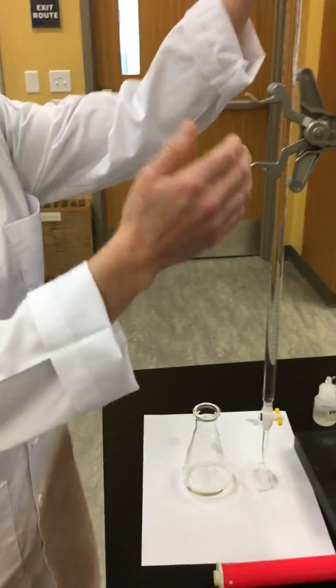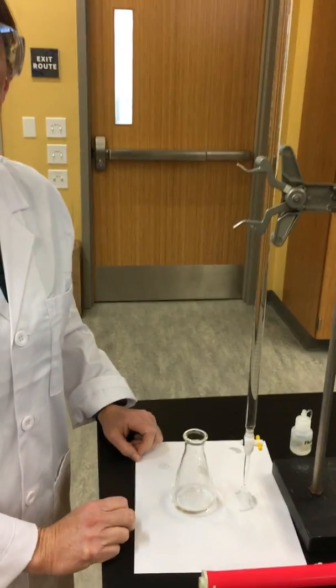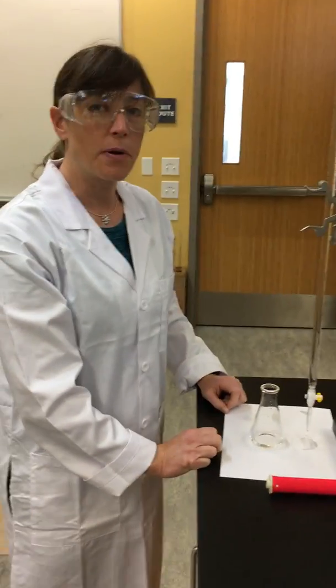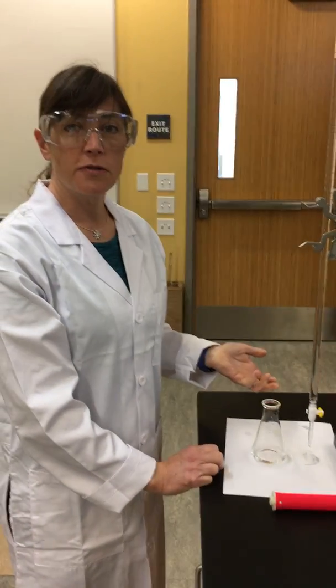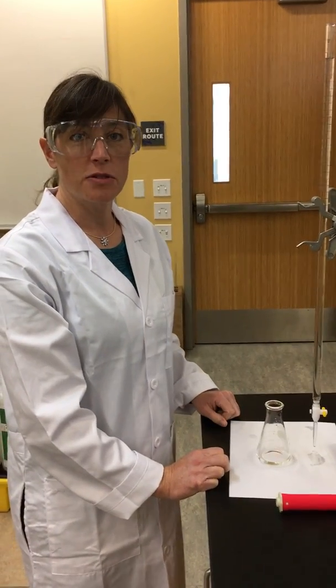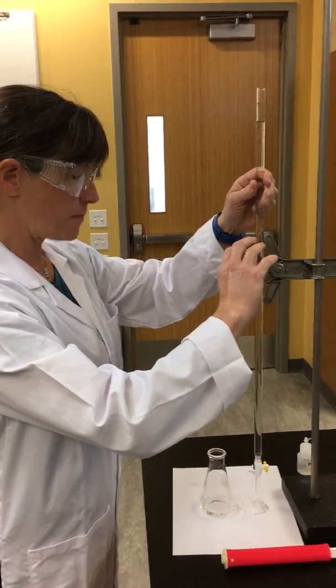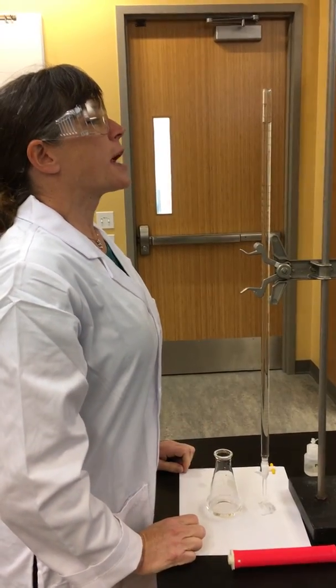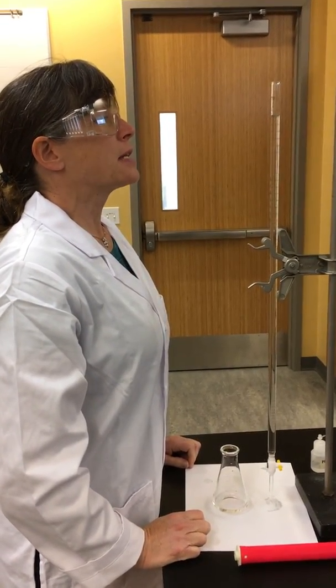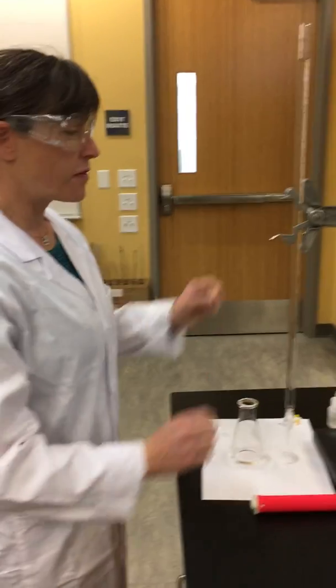I already have our burette filled with the same sodium hydroxide solution that we determined the concentration in part A. So what we're going to do first is record the initial volume of sodium hydroxide. We'll bring it down to our eye level. And we have 0.90 milliliters as the initial volume.